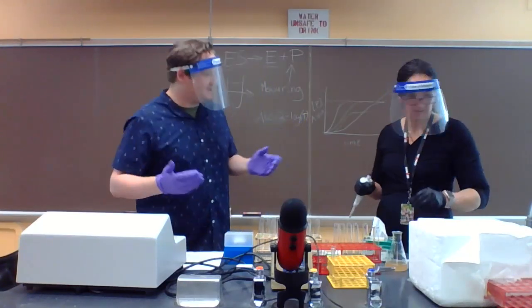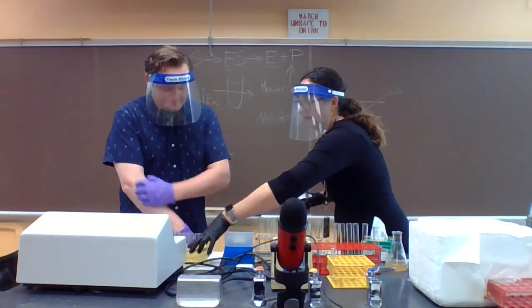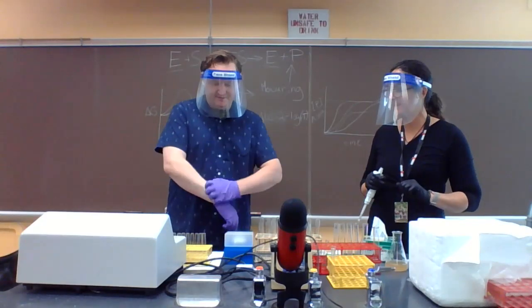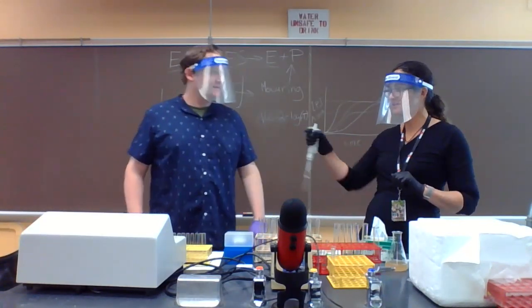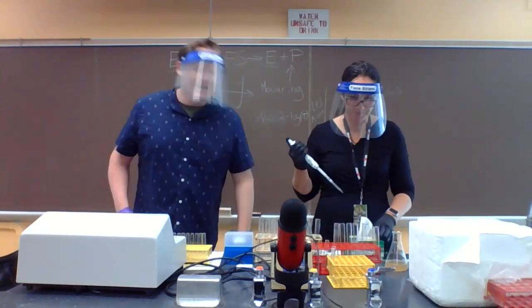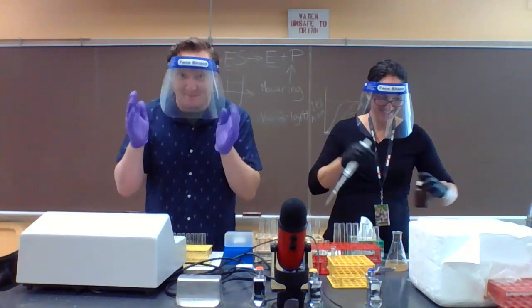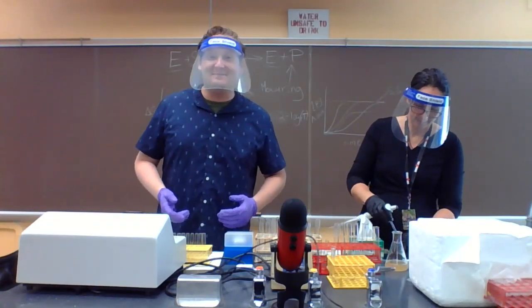And let's see. So you'll add the catechol, and then I'm going to add the catechol, start the timer, and hand you the tube. Perfect. I'll vortex it, then I'll hand you the tube, you pour it into the cuvette and measure. Perfect. Okay, teamwork. Yeah, and that's just an essential step in this lab, is taking the minute to just make sure we all have a clear game plan.